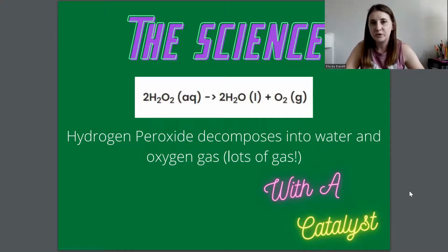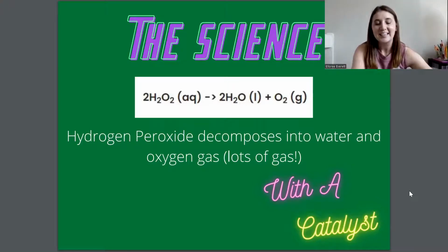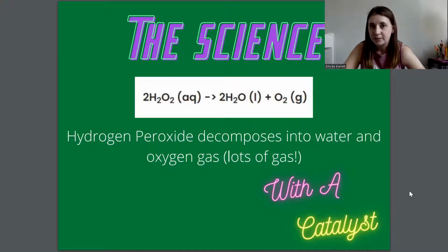Hydrogen peroxide naturally decomposes into liquid water and oxygen gas, but it does it very slowly. And we want to make a big mess really fast. So we need a little help speeding up this process. So we're going to use a catalyst. You remember that word? I know, it's been a while. It's the start of the school year. It's painful to hear all these science terms. A catalyst is something you add to a chemical reaction that helps the reaction typically occur faster.